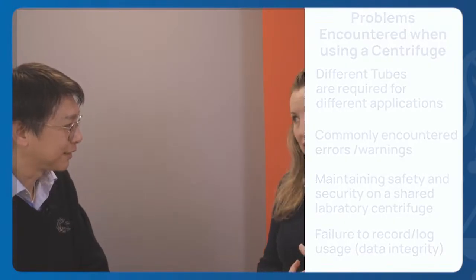Okay, so you listed a few common things there. So we had different types of tubes on the centrifuge, different errors for user errors, multiple people using the centrifuge and locking themselves out. And then compliance as well, logbooks and how people use that. So these are all very commonplace. They're not just something that would happen with our systems, they happen with every system, in every lab. Probably lots of our audience are listening and going, yeah, we've seen that happen. How can we help them?